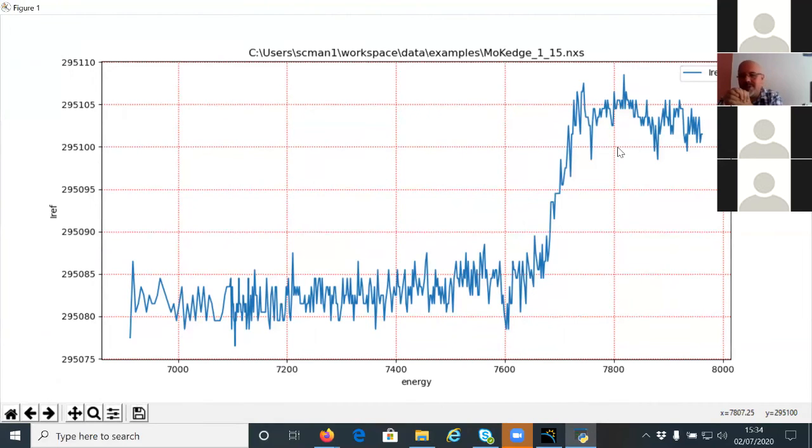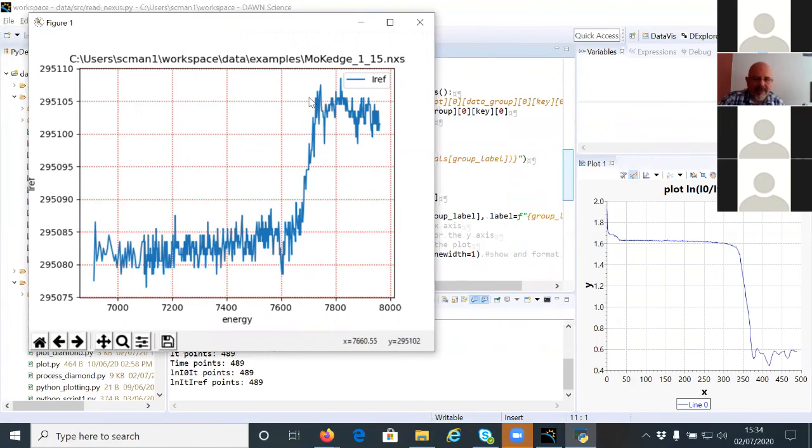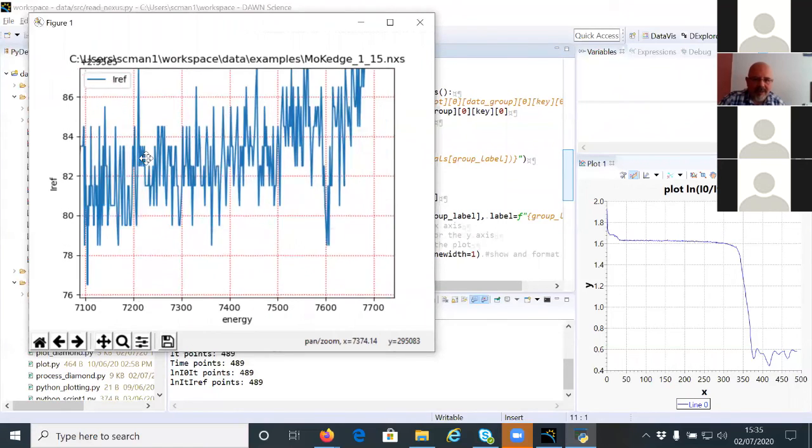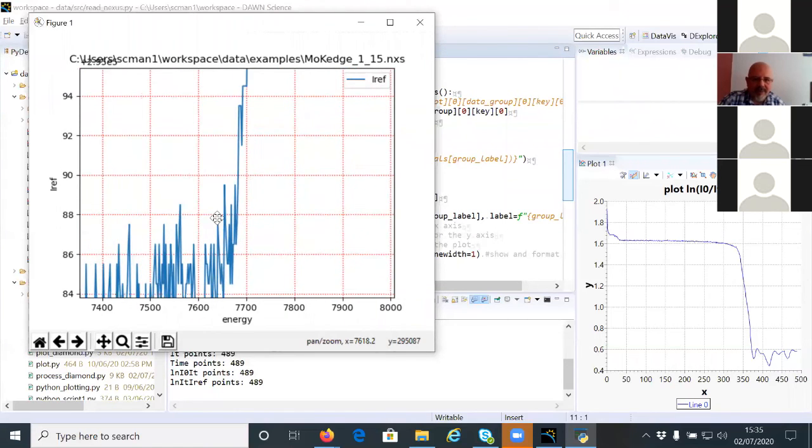You can do it, but you can do it in different ways. You can use the commands. These buttons in the lower part of the figure control what we do with it. So this is for zooming in. This is for dragging and dropping when we have a zoom.